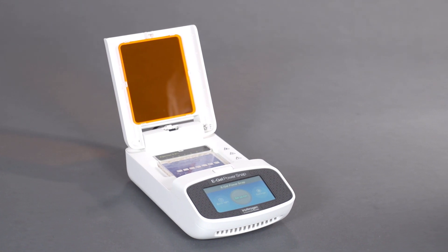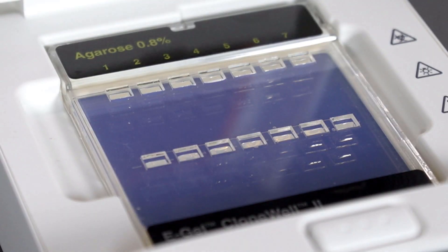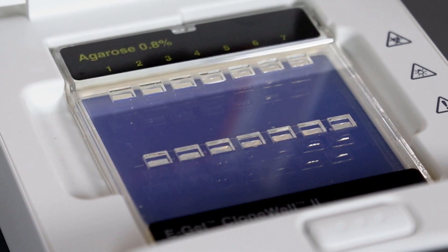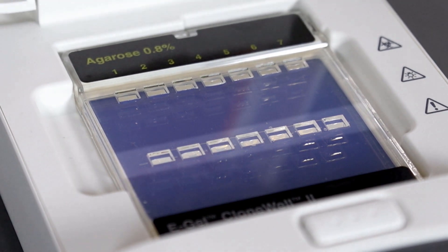The eGel CloneWell2 gel contains two rows of sample wells. Load your samples into the top row and collect the purified fragments as they pass into the bottom row collection wells.